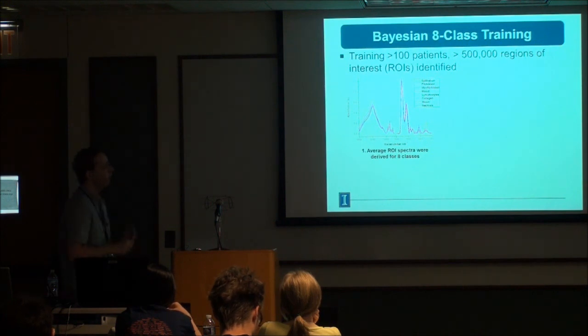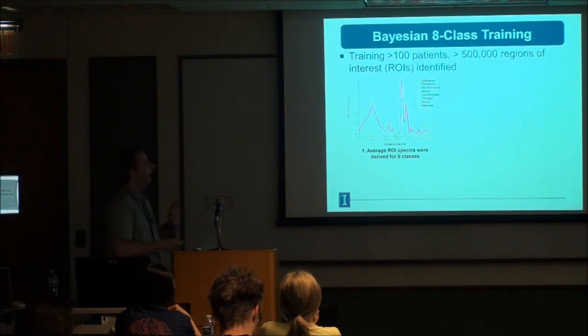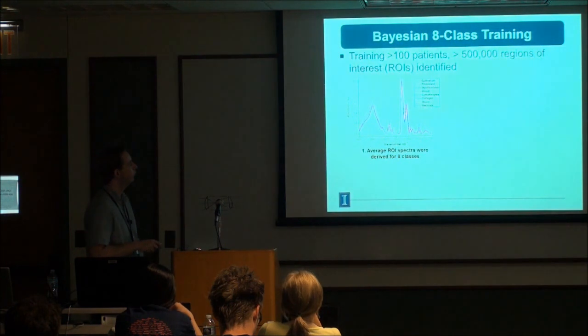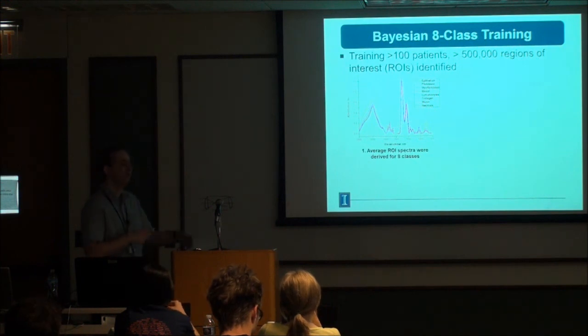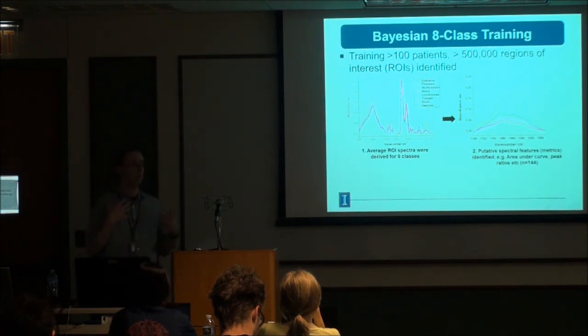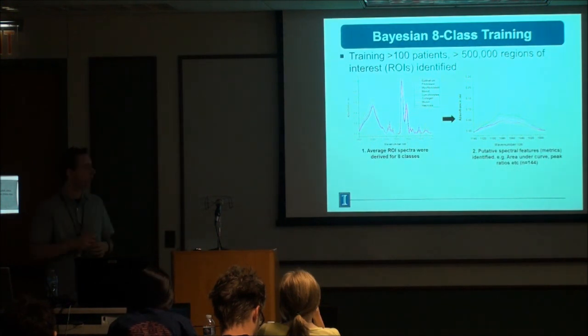As I said earlier, the difference actually with mid-infrared and even Raman is very, very small. So you can imagine why, as I said earlier, the sort of univariate type of analysis really is very useless for this type of work. It's useless for the clinician, and for more complex systems, it just falls down. So essentially what we do is we go through and we look for putative spectral features. These can be absorbance increases, they can be peak shifts, they can be area shifts.